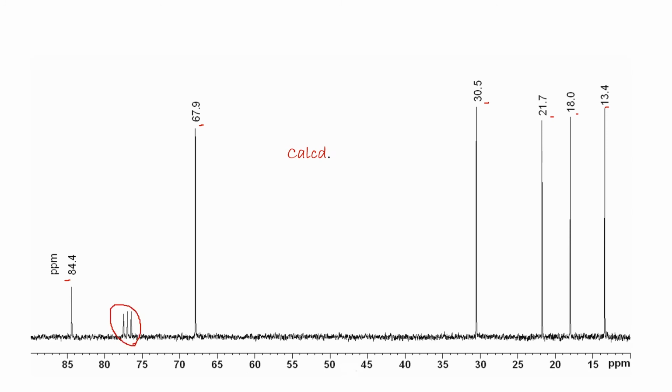This is the solvent signal, chloroform. For the proposed structure, hex-1-yne, this carbon is 68.6, and we are seeing it at 67.9. Here is 83.7, here is 84.4.